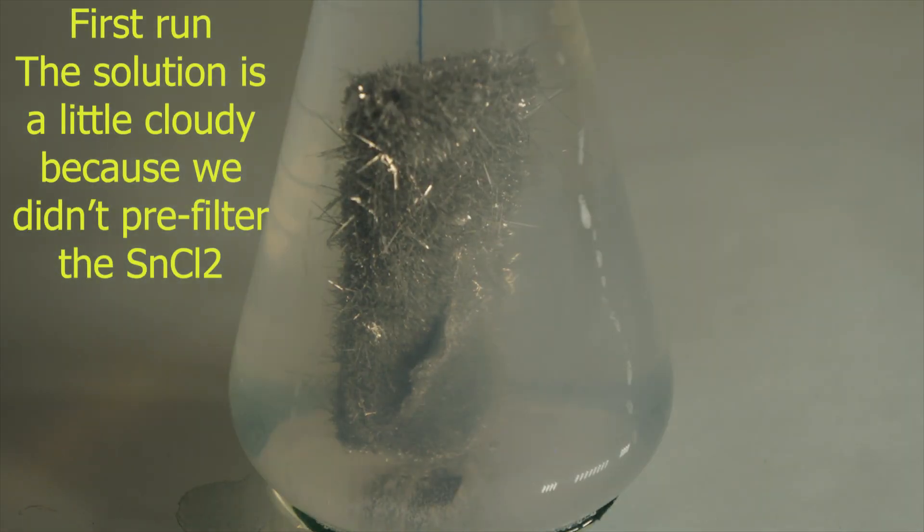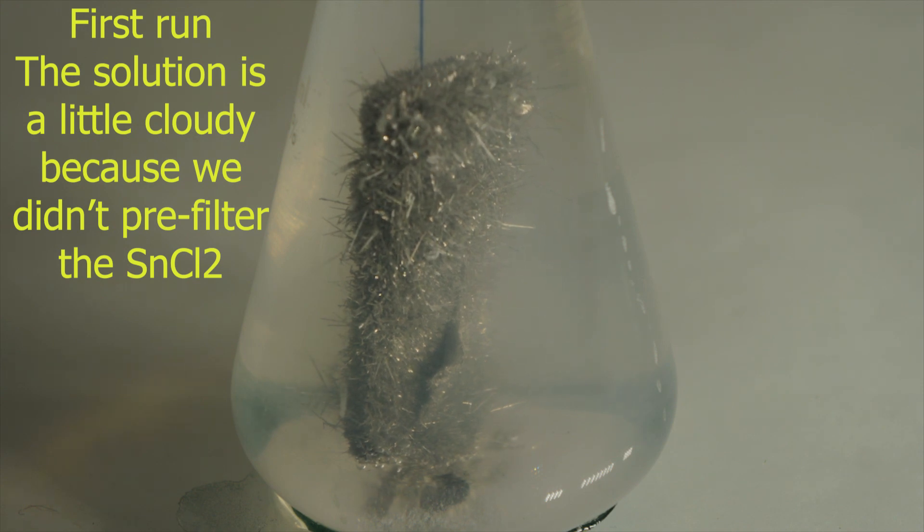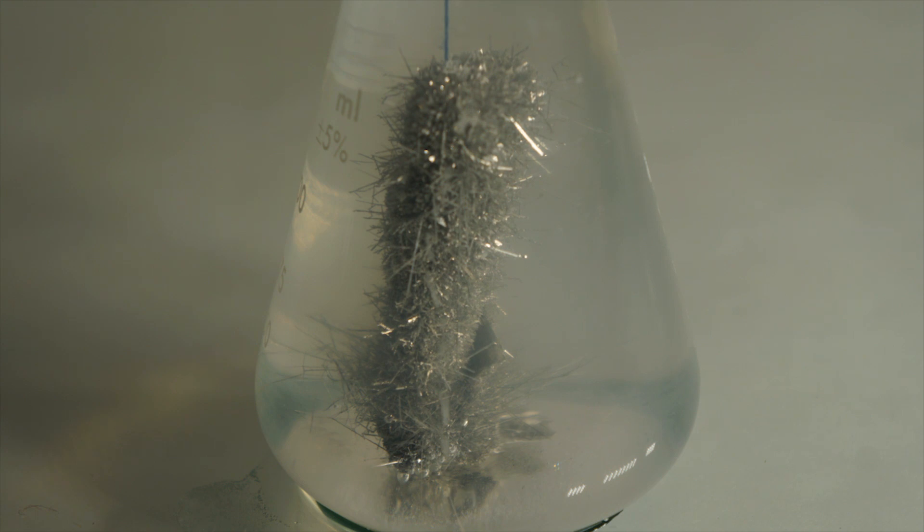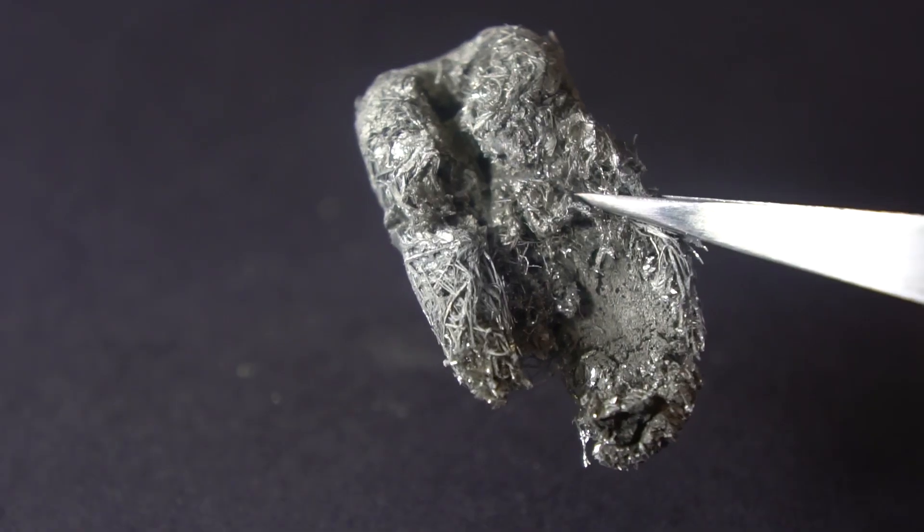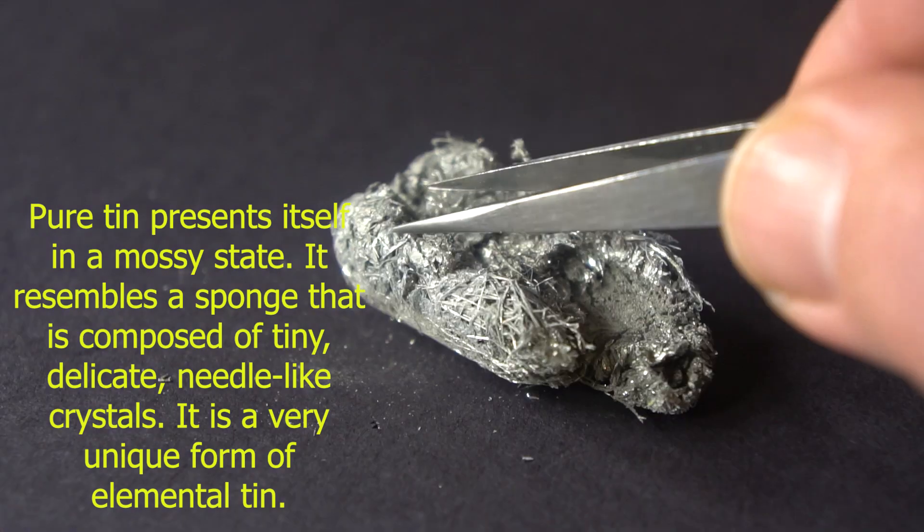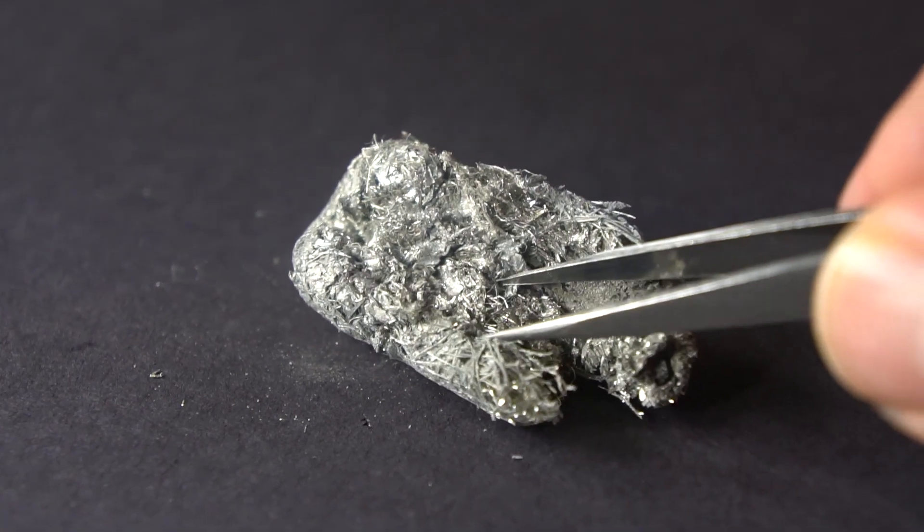The first time we ran the experiment, after 24 hours the zinc was gone and the tin floated to the surface and coalesced into a mossy state. We call this tin mossy tin. We were able to drain the solution and pull the pure tin out of the flask.